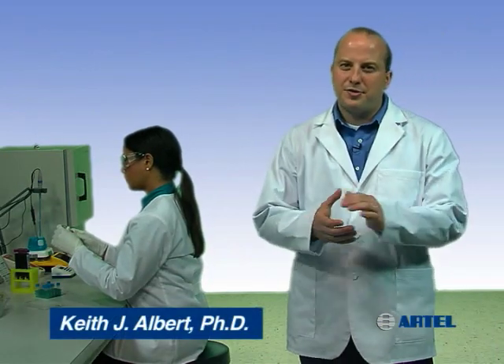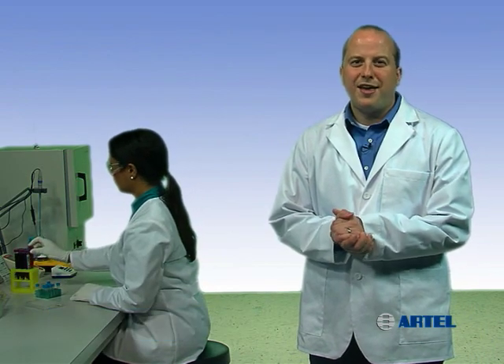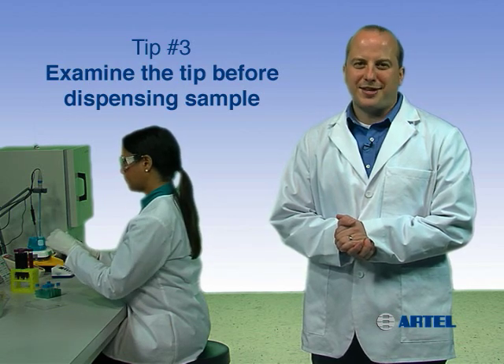Trust your assay results and ensure liquid handling quality in your lab by using proper pipetting technique. Pipetting tip number three: examine the tip before dispensing sample.